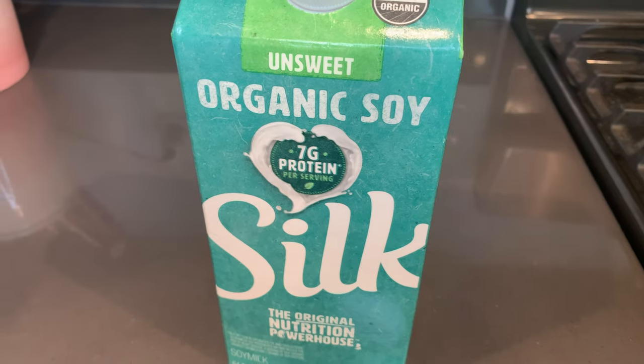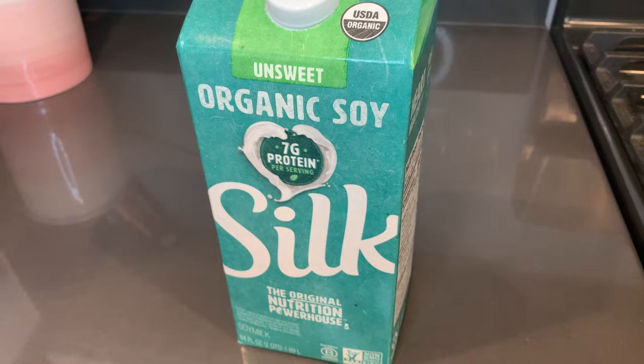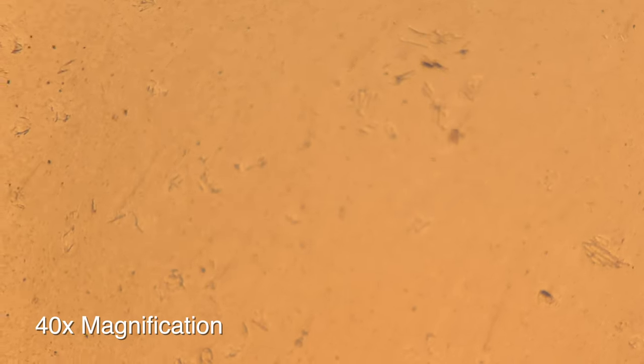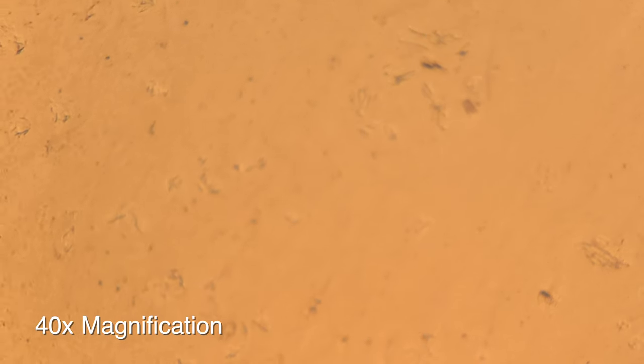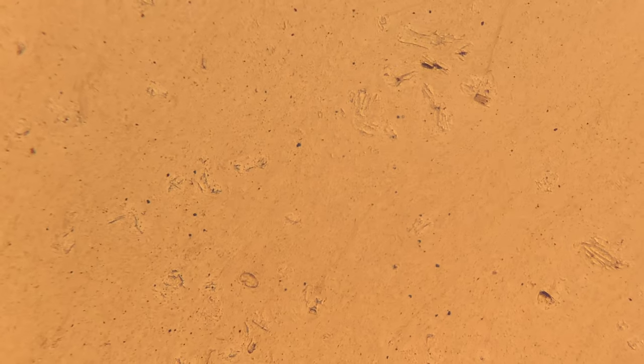Last but not least, we're going to look at the soy milk. This is essentially soybean juice and filtered water, so obviously this one's going to look a lot different. Basically, what we're looking at is just the ground-up remains of soybeans. It's not too exciting, but it's kind of cool to see the difference between this and all of the other milks.